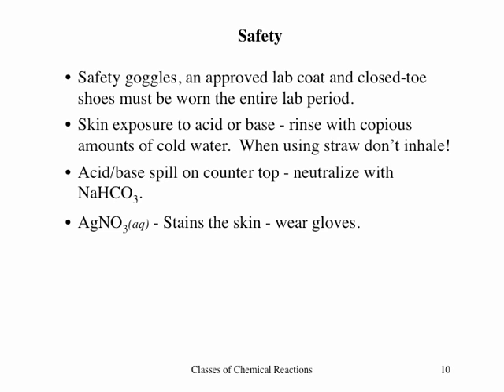Standard safety precautions include wearing goggles, an approved lab coat, and closed-toe shoes. Any skin exposure to either acid or base must be immediately rinsed with large amounts of cold water. Your TA will neutralize any acid or base spills on the countertop with sodium bicarbonate. Silver nitrate is not considered dangerous but will stain the skin. Gloves should be worn when handling this reagent.